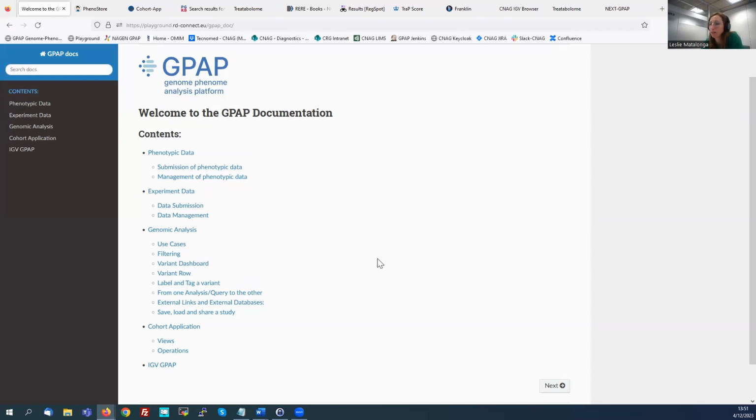Yes, as Leslie says, we're taking it bit by bit and getting there, but we're certainly close to being able to, through our work with ORDO, obviously we're more familiar with these types of variants now, and we hope to be able to incorporate them soon in the platform view.